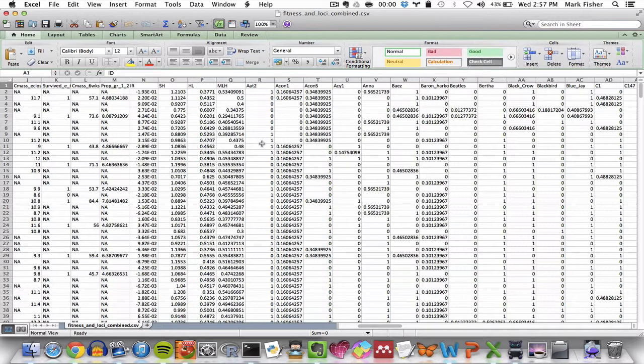So whereas these are missing data in heterozygotes and homozygotes.csv, here they get replaced by the mean across all samples that do get scored at that locus. The reason it does this is because this is what was recommended for the single locus association test in the original documentation, the original articles.